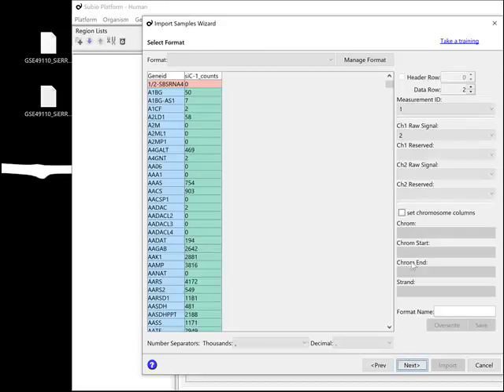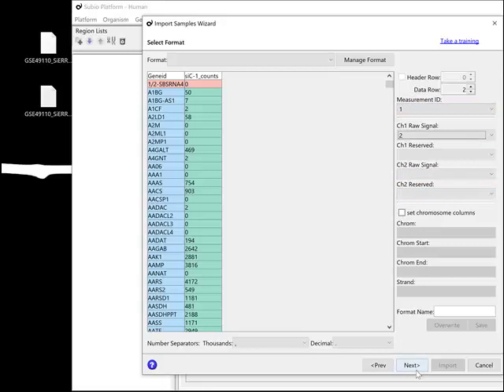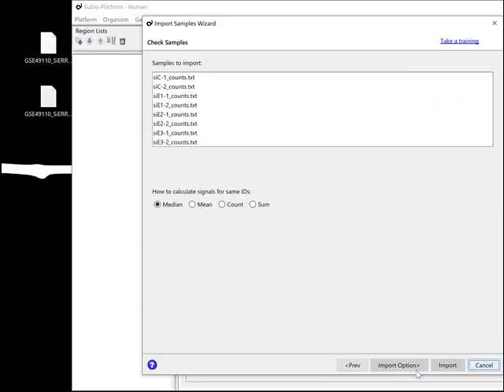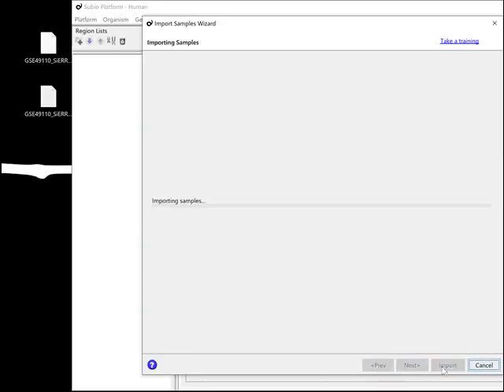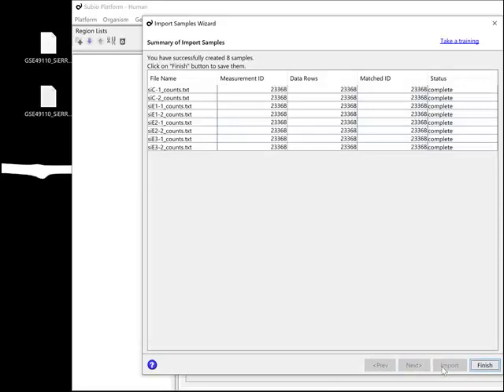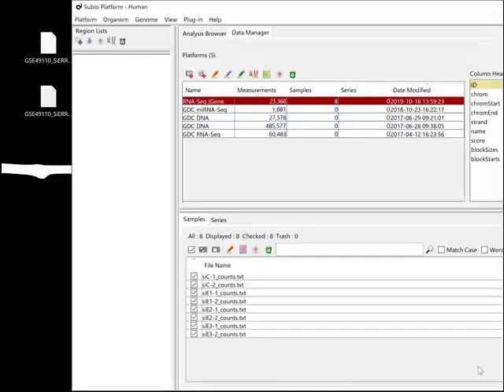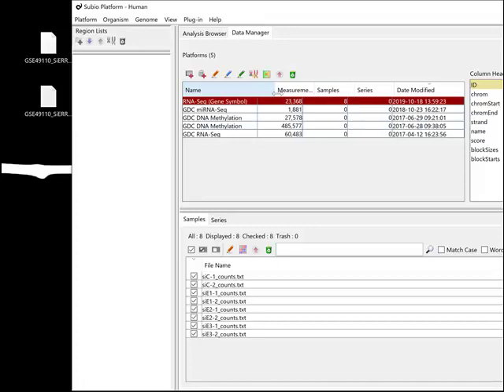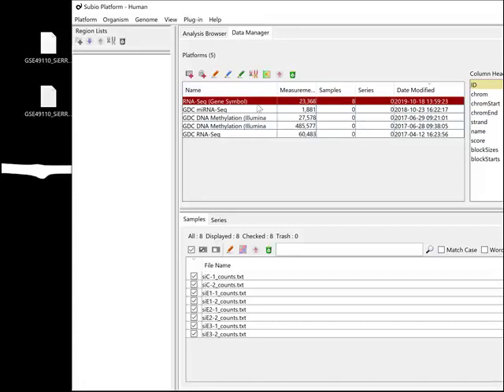The first column is the ID and the second is the signal. Let the import process complete. Now you have a new platform with 23,368 genes and 8 samples.